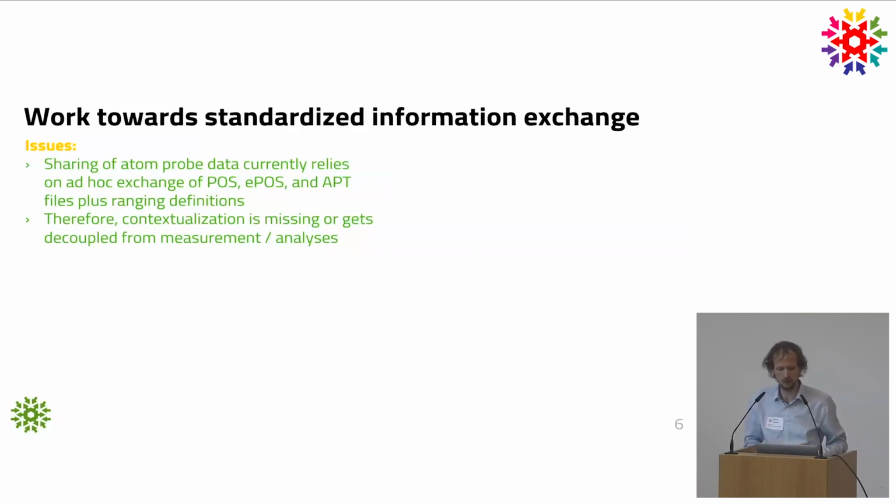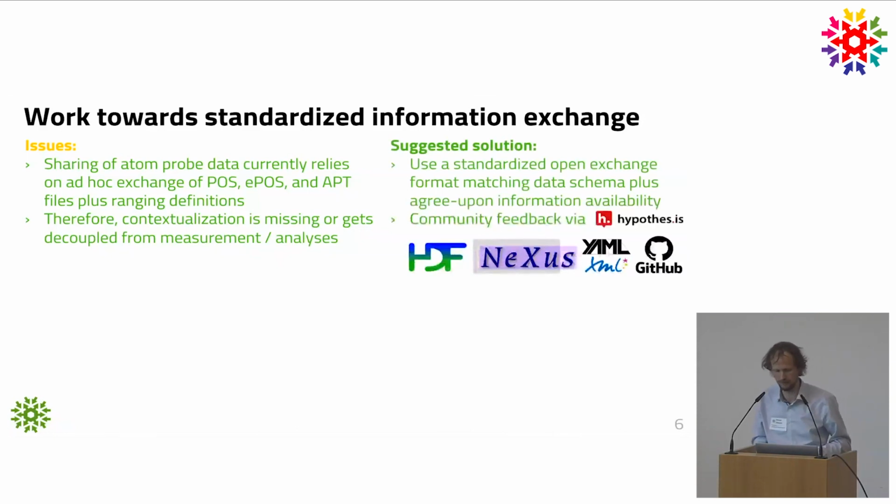Or you could also upload these POS files directly in NOMAD, and then that parsing routine that we've developed would start automatically in NOMAD and would create this data artifact for you, and you can exploit it in NOMAD. This is the solution that we decided. So we went for a standardized open exchange format that combines a data schema and an agreed upon information availability.